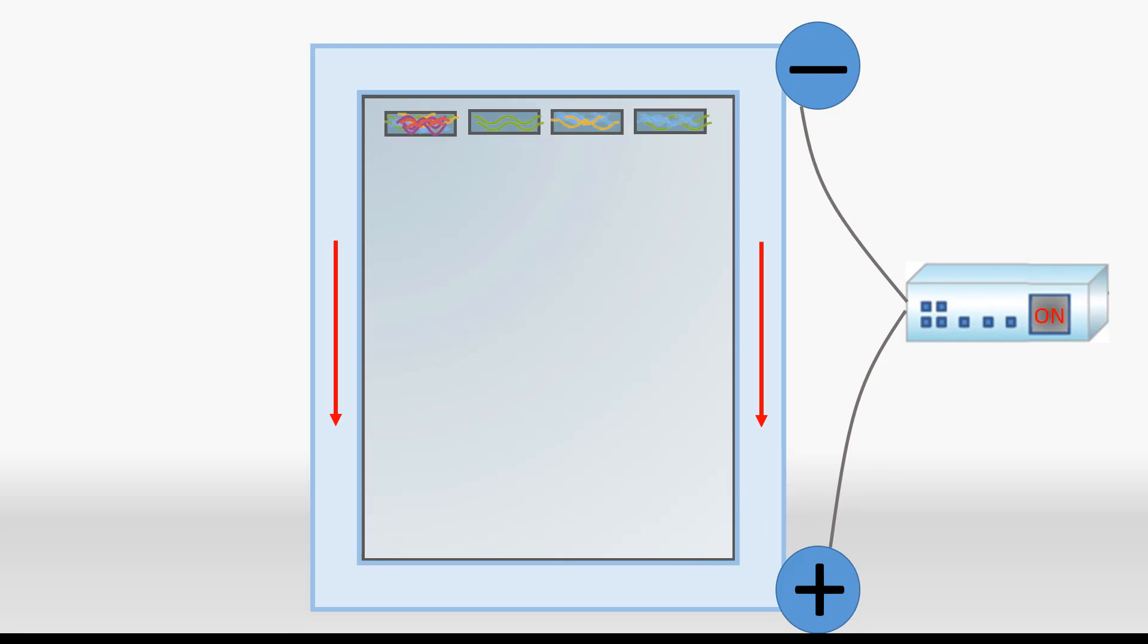Let's look at another gel. Typically, a molecular marker or a DNA ladder is loaded alongside the rest of the samples. This ladder is a mixed solution of DNA fragments of known sizes.